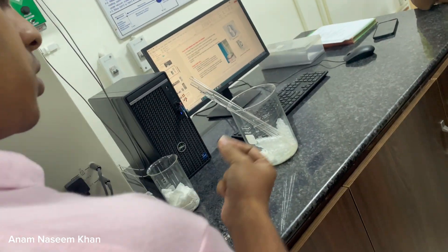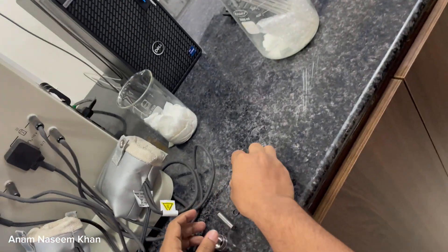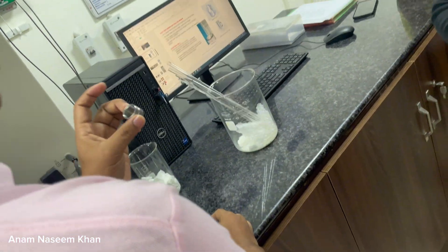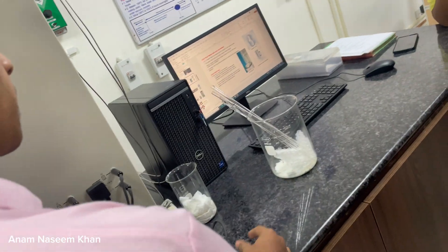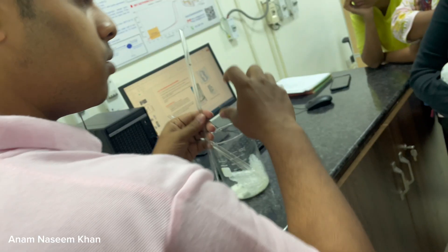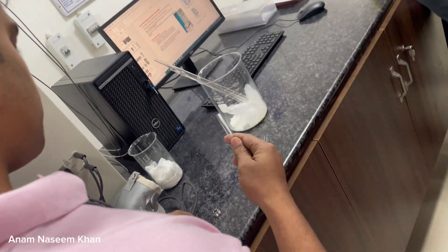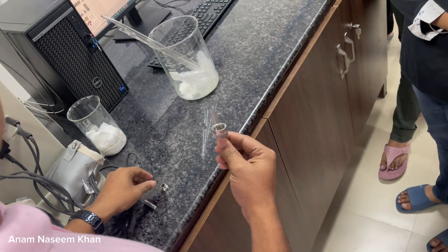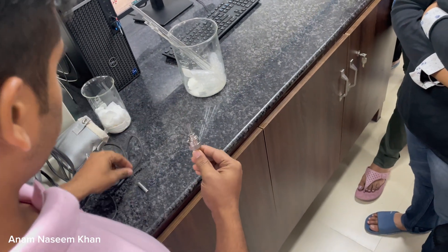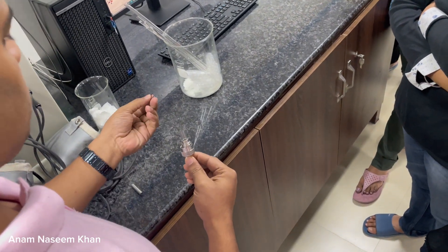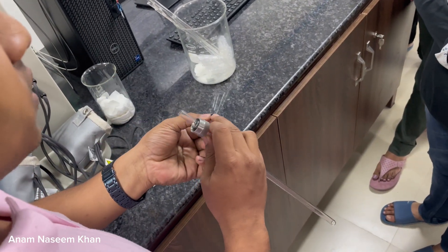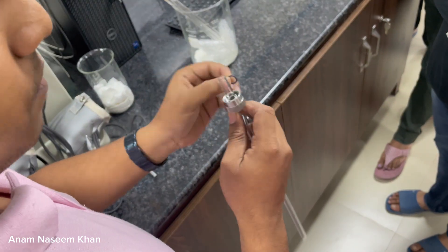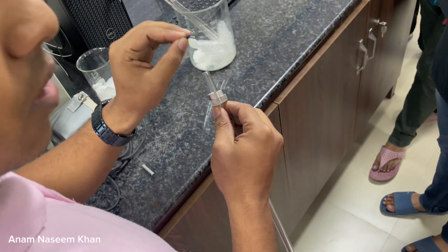The assembly components are: this is called the o-ring, this is called the metallic sleeve, and this is the newer retainer ring. The sample is already filled in the tube. Now you pull on this, then this, then the o-ring. The o-ring has two parts — one side is totally flat and the other has a small ring. The flat part should face downward.